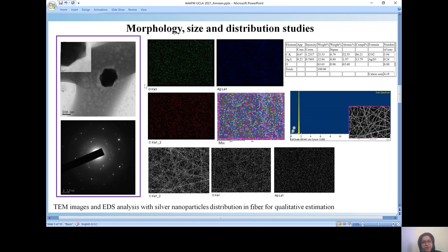In order to see whether the nanoparticles were present inside the fibers, we carried out the TEM analysis of the fibers along with the nanoparticles. Here are the diffraction images showing that the nanoparticles which is present inside the fiber is of monodispersed nature. Further, the areal spectrum was done through the help of EDS. EDS analysis showed that the nanoparticles are distributed uniformly inside the fibers.